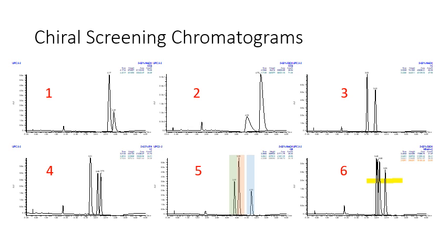And what we expect from this is that fraction 1 and fraction 3 will produce individual isomers, but fraction 2 will have 2 isomers in it. Fraction 2 may have a pair of diastereomers, or it may have a pair of enantiomers. We don't know. But we can use the UPLC chromatogram to sort this out.